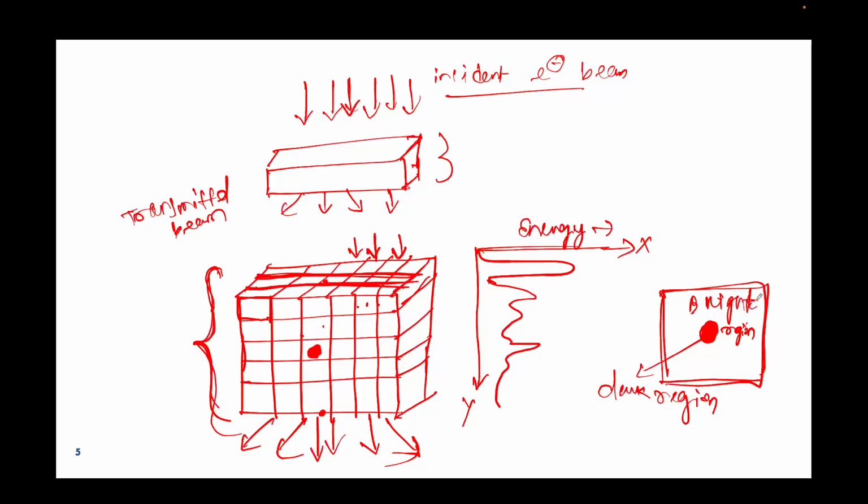So that is why, when I talk about depth sensitivity, it means we cannot know for sure at what penetration depth this particular feature of our sample is coming from, and that is why the information that we get is always averaged. Here, I want to give you some additional information. You have seen I have drawn a different set of atoms. So one atom will be one atomic column, another atom will be an atomic row.